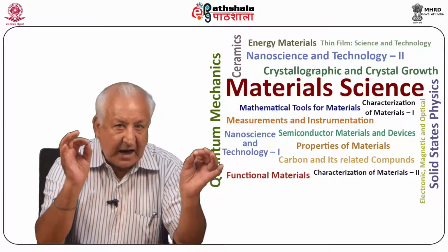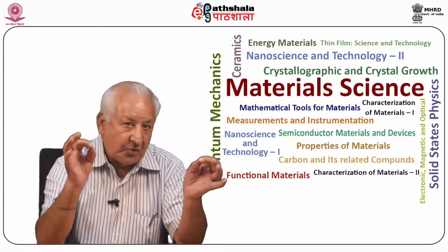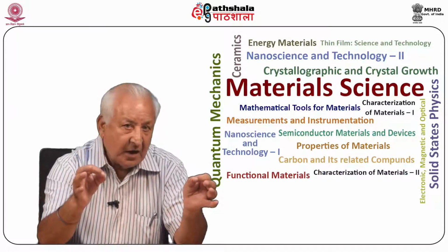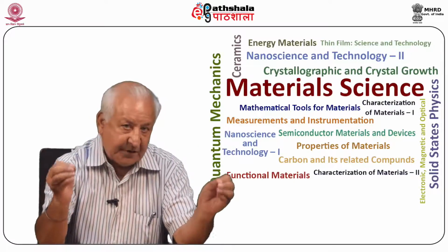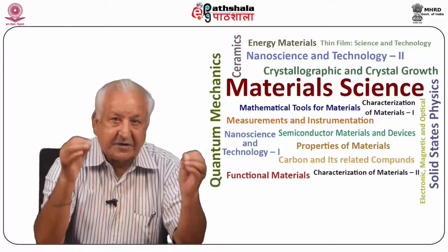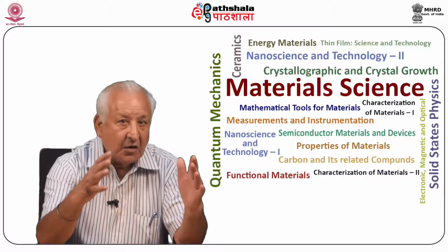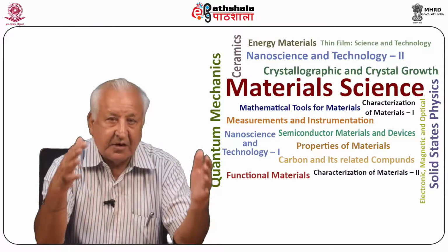It means that any single spot in the crystal should be imaged as such in the topograph. That is what is actually meant by one-to-one correlation between what exists in the crystal and what gets imaged and registered in the topograph. To enable this to happen, certain experimental conditions are required to be met. Let us describe those conditions which will have to be realized in order to obtain one-to-one correspondence between what exists in the imperfect region and what is detected in terms of contrast of the topograph.